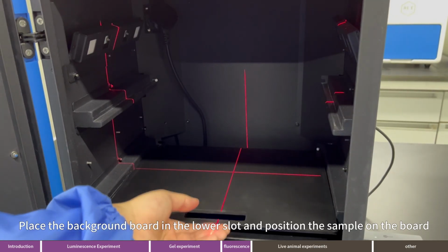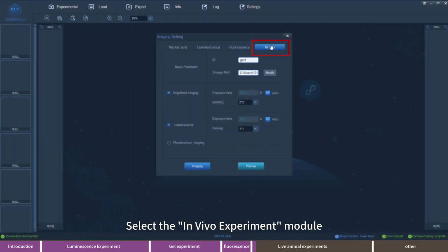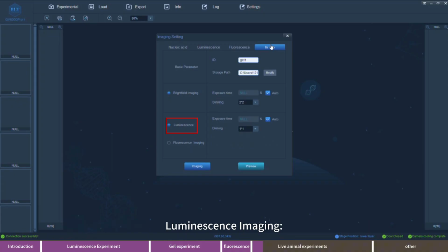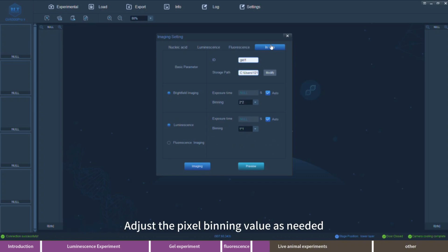Place the background board in the lower slot and position the sample on the board. Select the In Vivo Experiment module. Choose between luminescence imaging or fluorescence imaging. Luminescence imaging. Set the exposure time or click Auto for automatic exposure. Adjust the pixel binning value as needed.